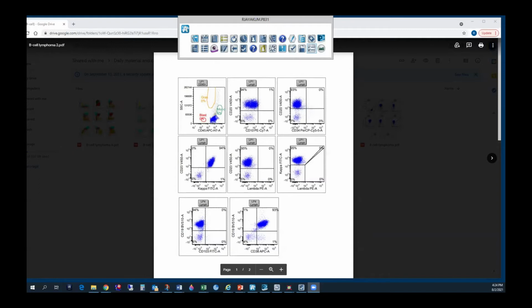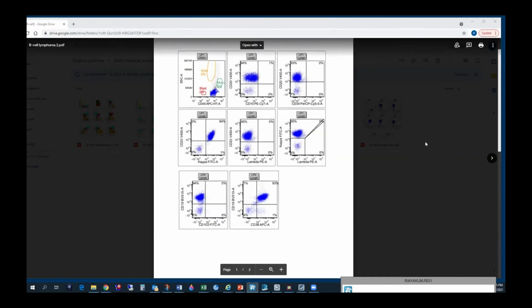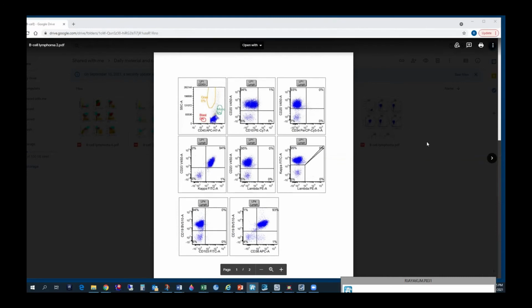It's also based on your practice, whatever your clinicians are used to seeing. One of our attendings, whom I convinced to also not do it, said he was called in a few cases because clinicians were misinterpreting those percentages and not understanding them. For example, sometimes you say CD5 based on T cells and you're not sure when you are saying it about B cells, and it becomes confusing. The clinician wonders what's going on and why this is there, and he gets confused. It's better to just avoid it, in my opinion.